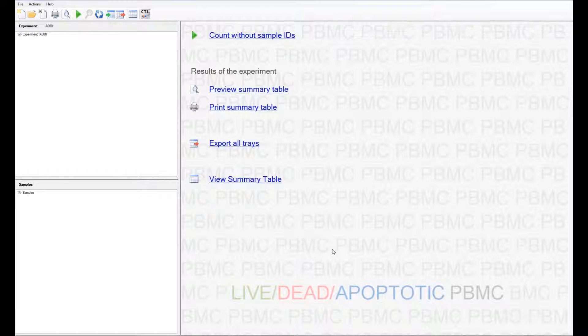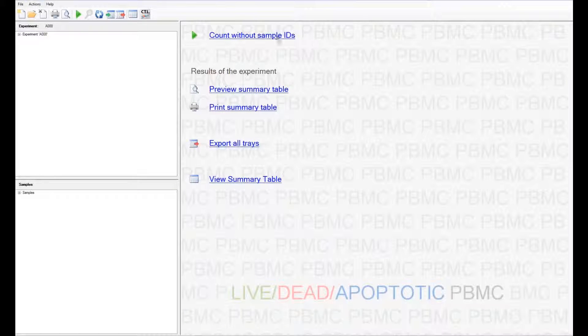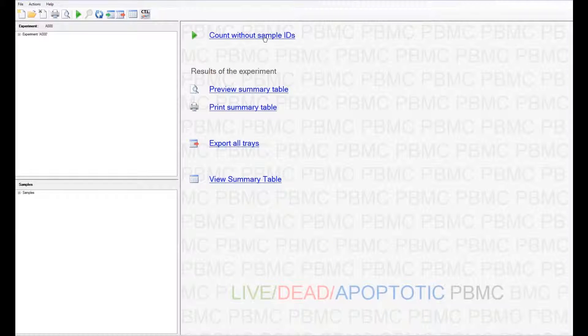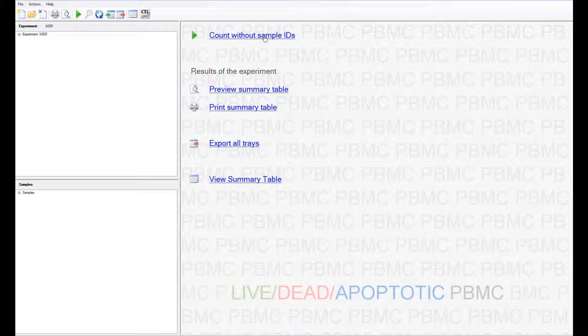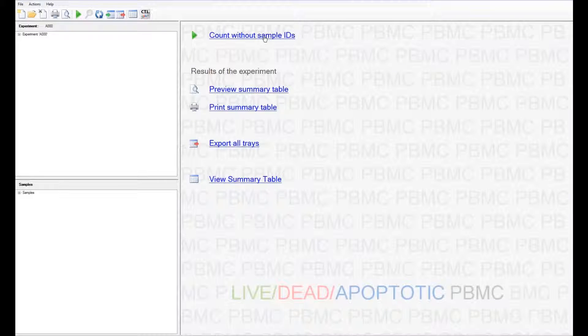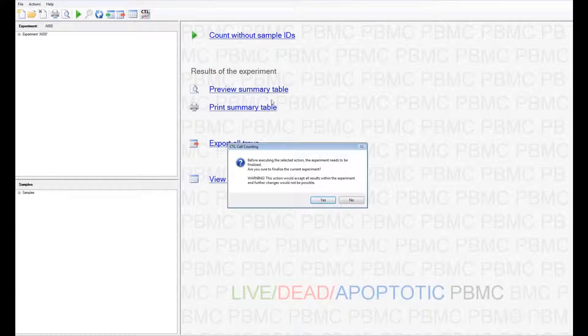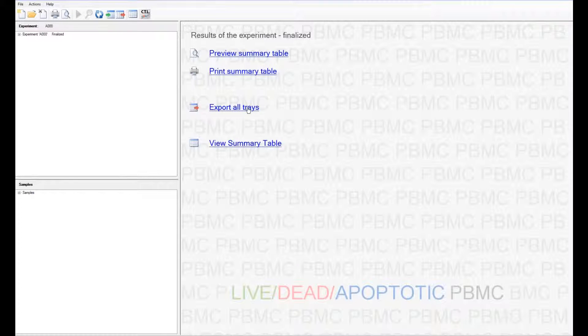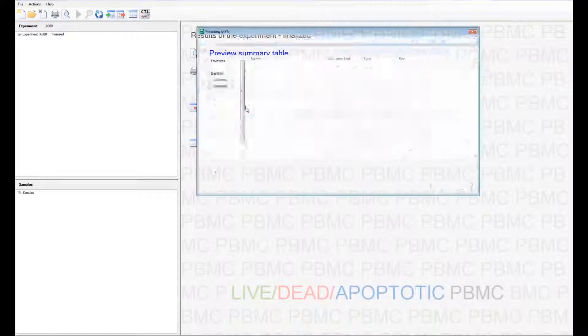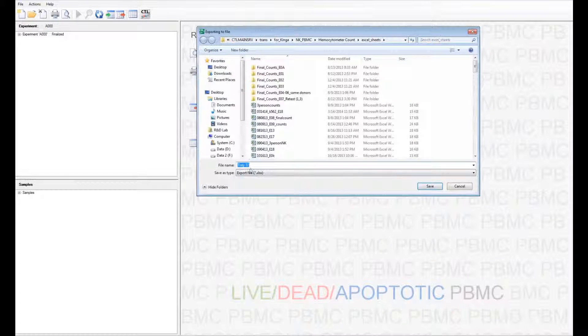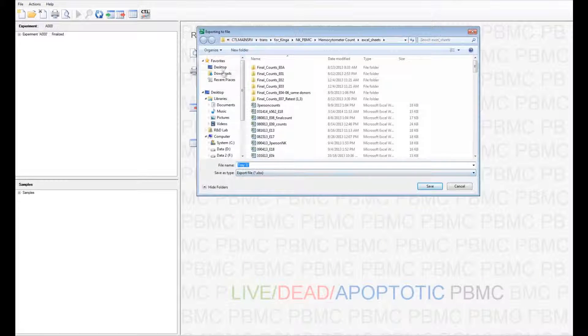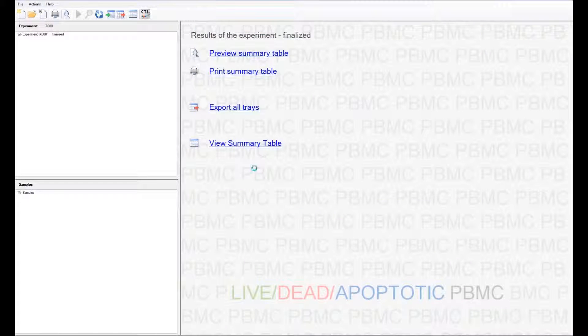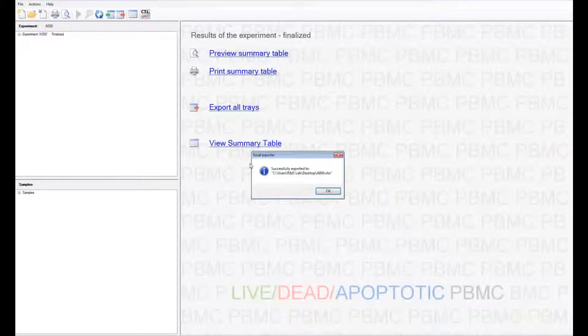After you're done with this set, you can add more samples and repeat this all over again using the Count Without Samples ID. You can preview the Summary table or print the Summary table one more time. You can also export the data onto an Excel sheet, which can be used for future purposes as well.